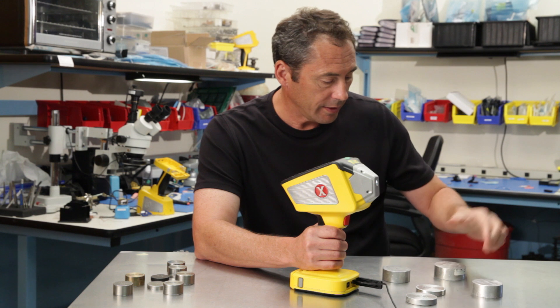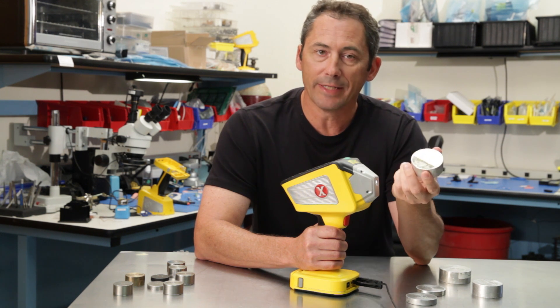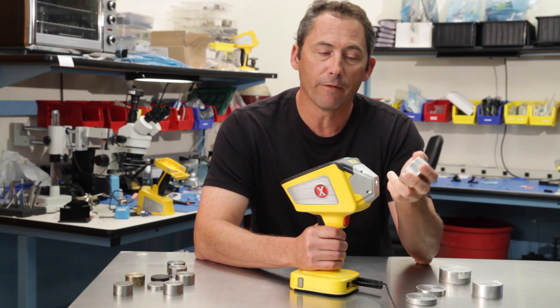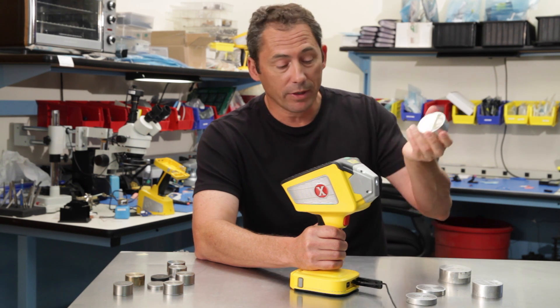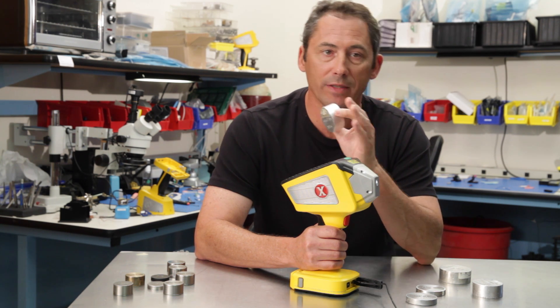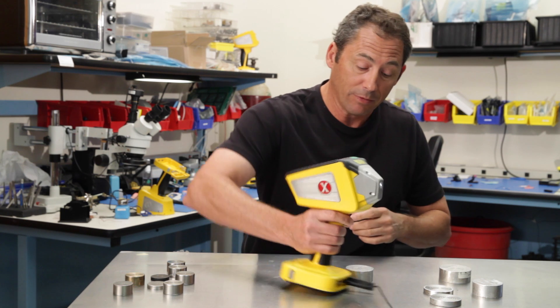Let's start with the hard one — this is aluminum alloy 6063. This is frequently misidentified as 1100 because you have to see the magnesium. In 6063, the magnesium is around 0.4 to 0.5 percent. Other X-ray guns may take as much as a minute to see that. What we're going to show you is that we can repeatedly see the magnesium in this 6063 in about a total six-second test: three seconds beam one, six seconds beam two — under ten seconds, many times faster than any other X-ray device on the market.